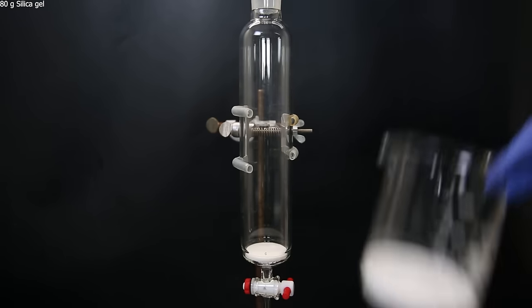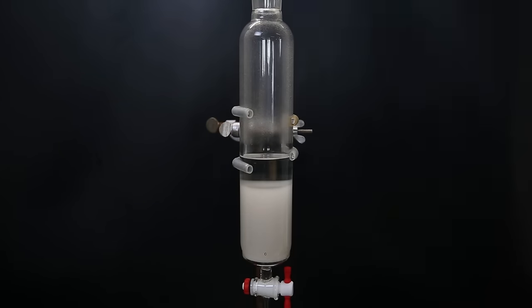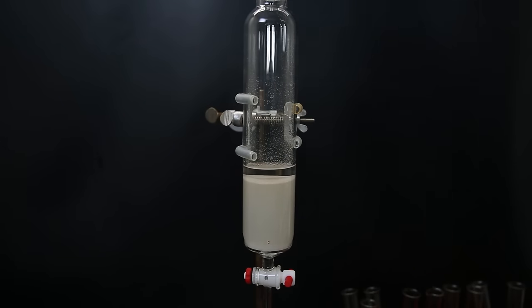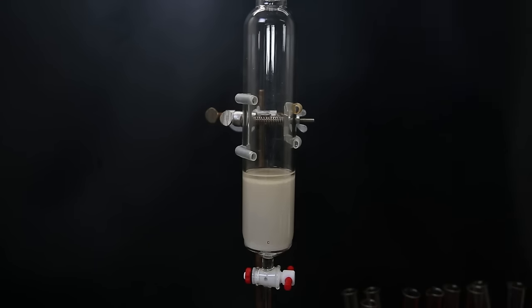I weighed out 80 grams of silica gel and mixed it with 20% ethyl acetate in hexanes. I added it all to the column and packed the layer of silica. I then put a layer of sand on top to protect the silica and run the solvent level into the sand. I then add all of my product on top with a pipette. I run that into the sand and then put more of the solvent mixture on top.